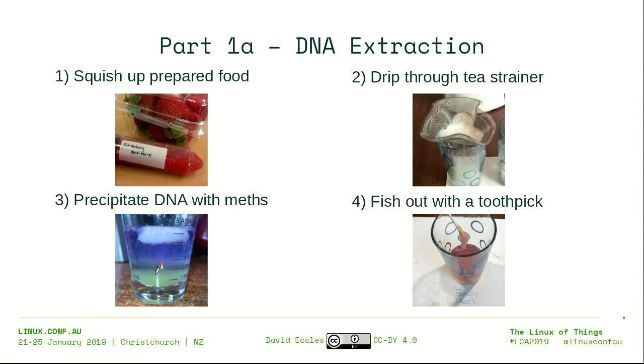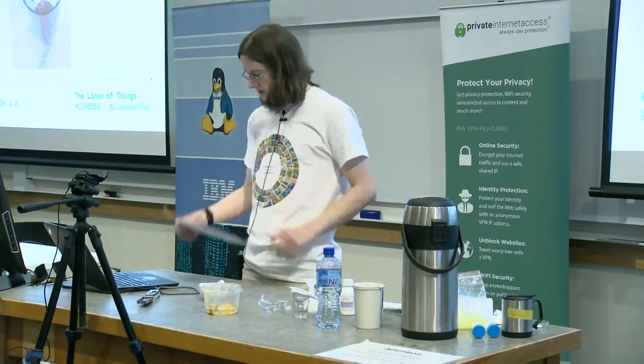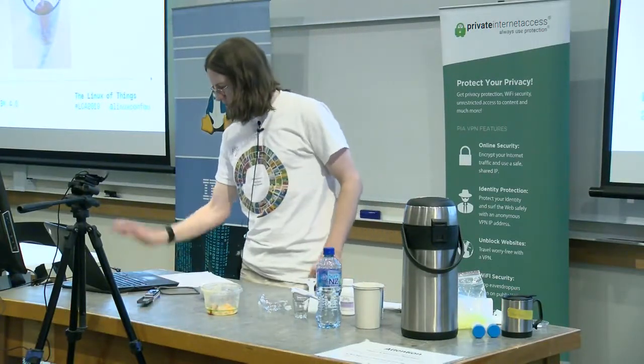I was originally going to try a 3-course meal, but the food at the speaker's dinner wasn't quite right for DNA extraction using this method. This here is a chickpea salad. Because I don't have much time on this stage, I'll be throwing a bit of standard DNA extraction process practice out the window. This means, as I keep repeating, that there's a chance that things won't work. But I've got a few backup options in the event that it all turns to custard. Right, let's get to it.